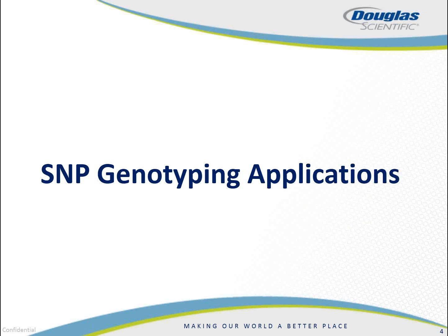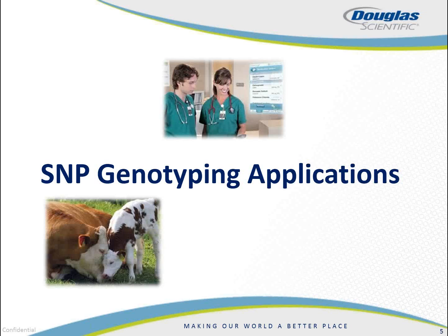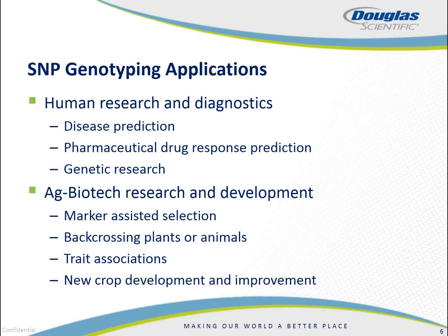Some SNP genotyping applications include clinical diagnostics, feed animal genetics and production, as well as crop development such as corn and soybeans. For human research and diagnostics, SNPs are used widely in disease prediction as well as pharmaceutical drug response prediction. SNPs are very informative to doctors as they're making decisions about which pharmaceutical drug to prescribe and which dose to prescribe to a specific individual, as well as genetic research. Ag biotech research and development uses SNPs widely for marker-assisted selection programs. SNPs are also widely used for backcrossing of plants and animals, as well as trait associations, and we'll be looking at an example of that later, and new crop development.